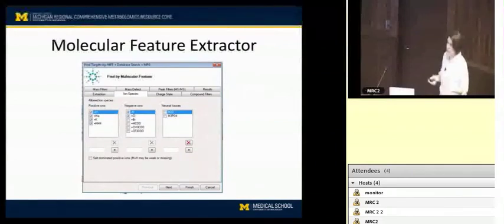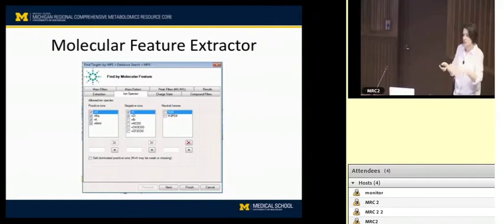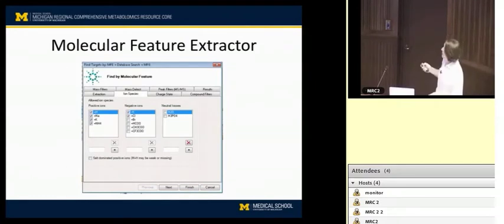Okay, the flip side of that is true. If you decide that you're going to collapse the sodium ion in with the molecular ion, then if it misses it once, that might skew your quantitation. So there's pros and cons to doing it either way, and we'll talk a little bit more about that later as well. But at any rate, you have to let the software do that, and if it does that for you, you'll see fewer features reported out because it will take two distinct peaks that belong together and collapse them into one feature. Does that make sense? Are there any questions about that?